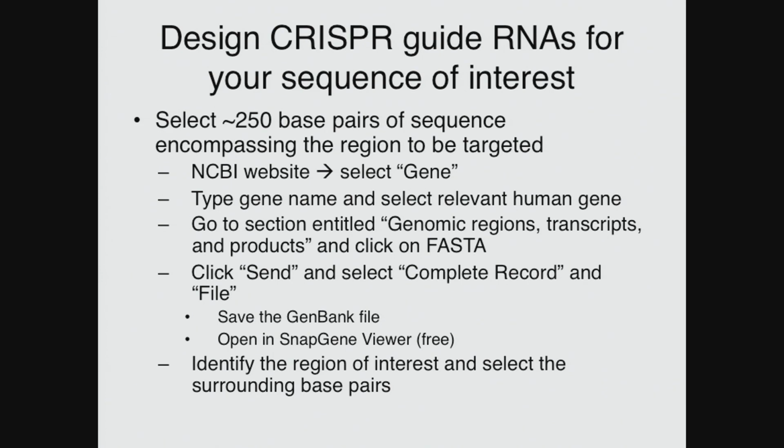Basically, I was just going to go through a potentially kind of boring explanation of the specific steps of how you design a guide RNA for a gene of interest or a region of interest, and then maybe we can have some time where I can show you on my computer how these steps actually look. I know some of you brought your laptops, so if people have specific questions, we can go over them then.